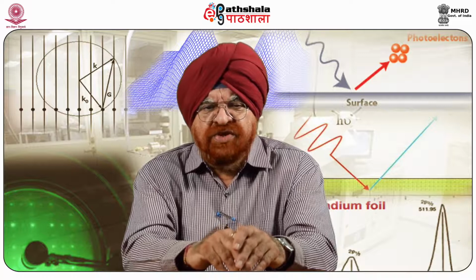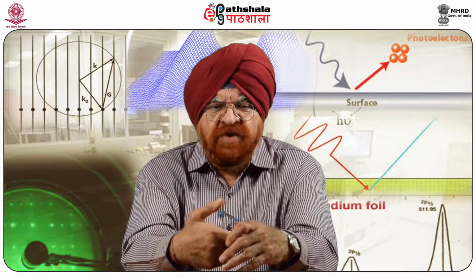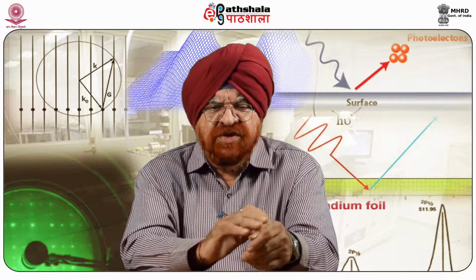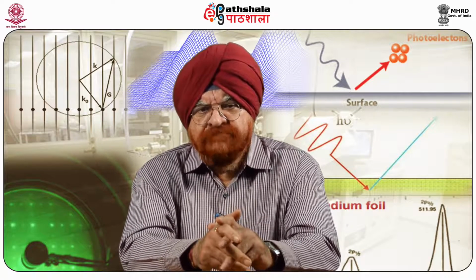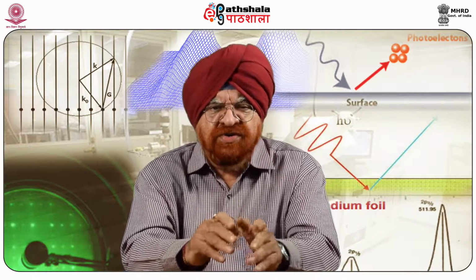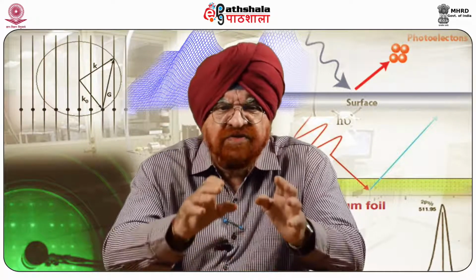By adopting this procedure at the bare substrate-film edge, the MFM tip will experience a signal difference which is proportional to the magnetic response of the probed region. Considering that the crystalline quartz gives no magnetic contrast in the MFM measurements, the observed MFM signal is exclusively due to the germanium manganese film.